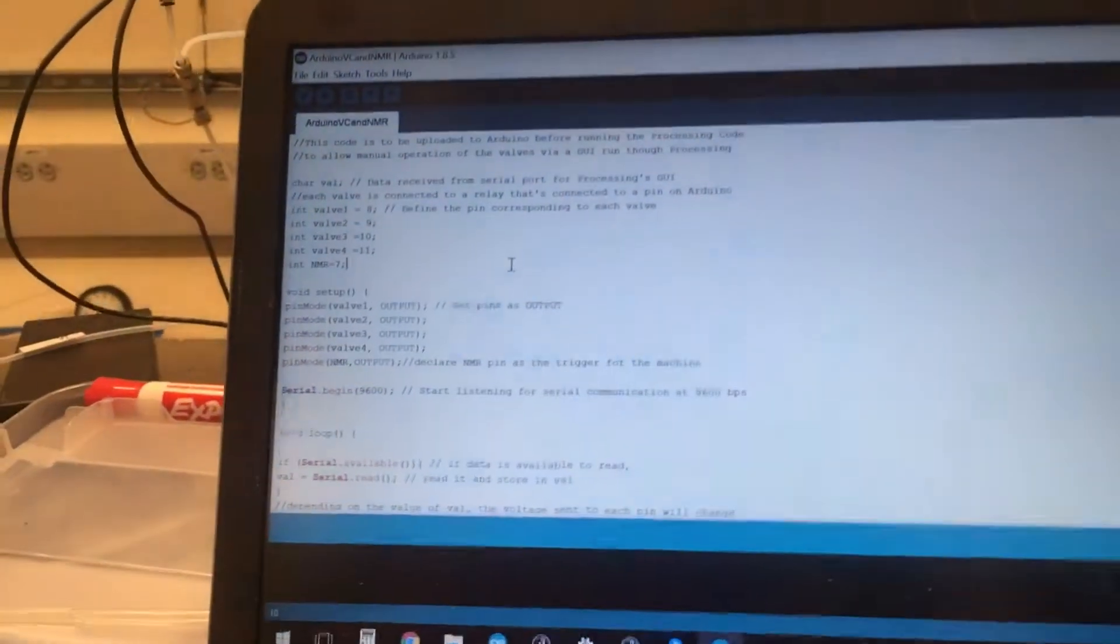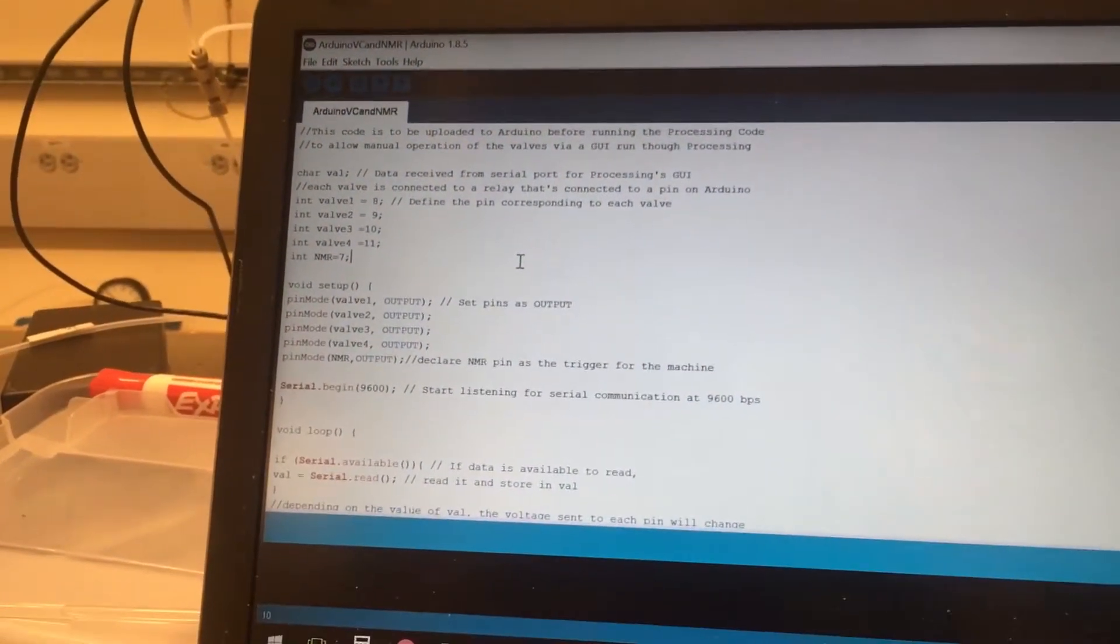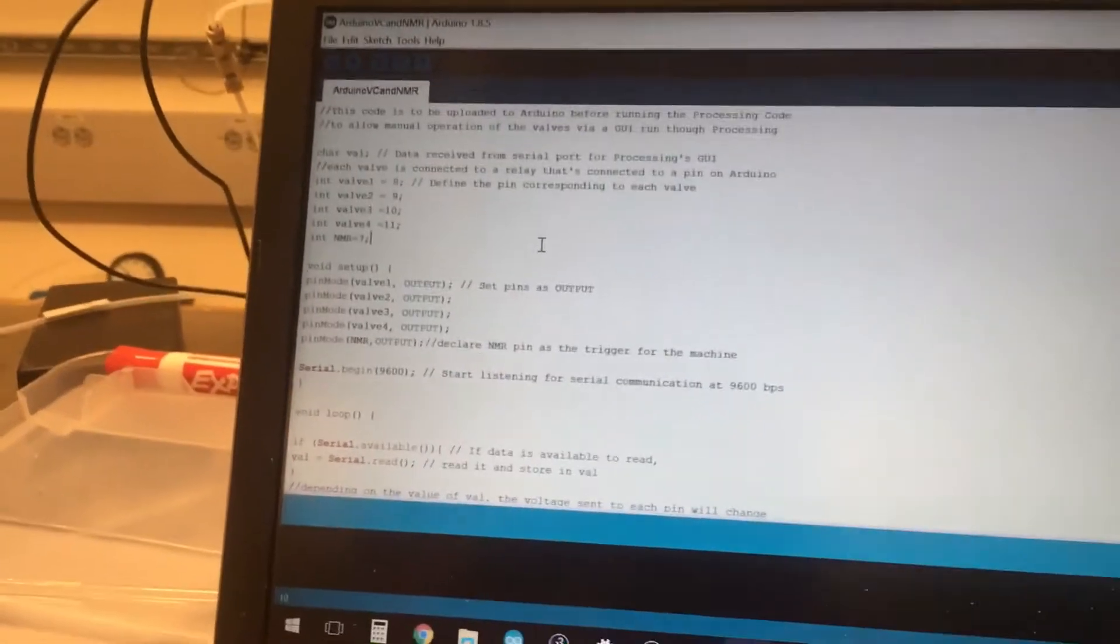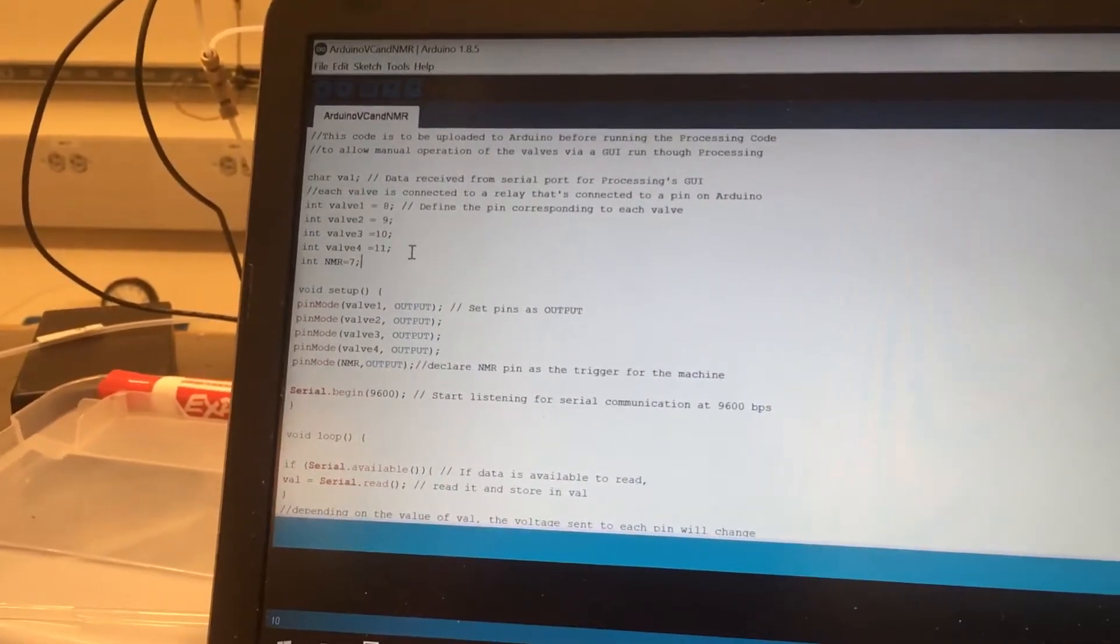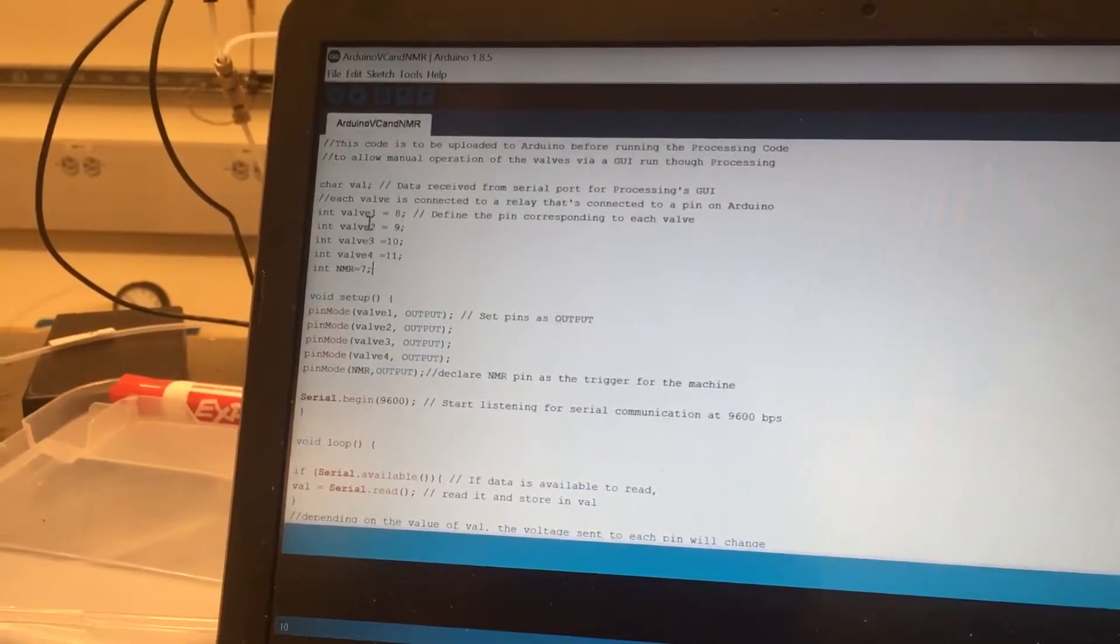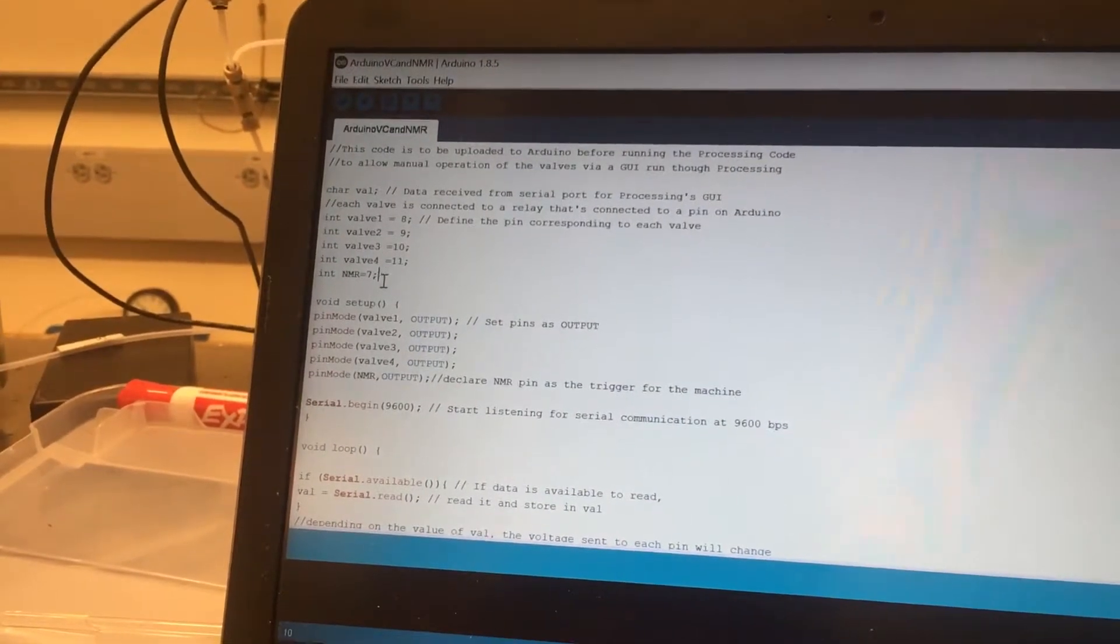So if we go onto the computer, we can see the code that's already been uploaded a priori to the Arduino here, and I've defined the pins as the valves that they operate. We've got valve 1, 2, 3, and 4, as well as the NMR trigger.